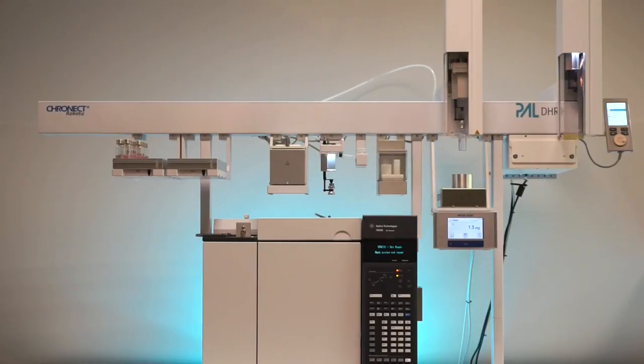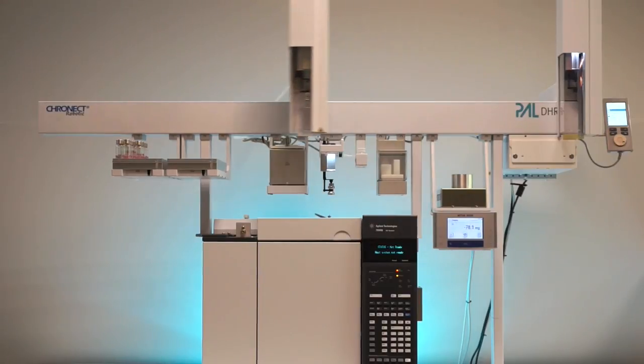The analytical balance measures the weight of the vial with the internal standard. Afterwards the vial is placed into the agitator for incubation.